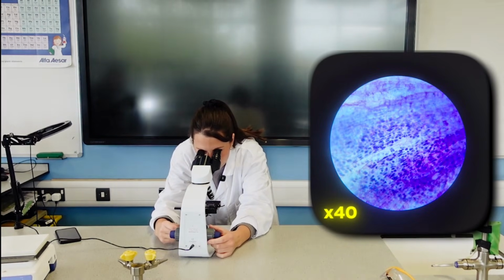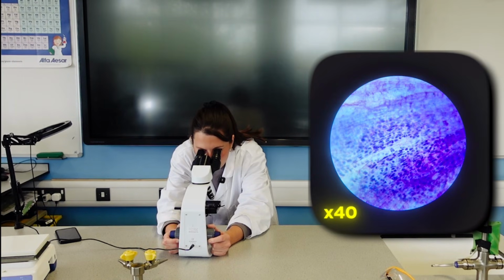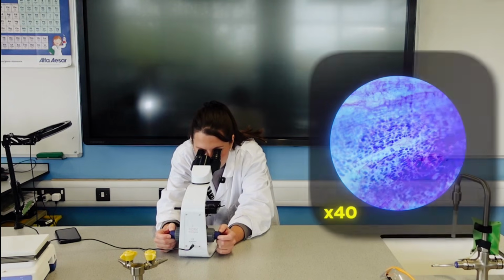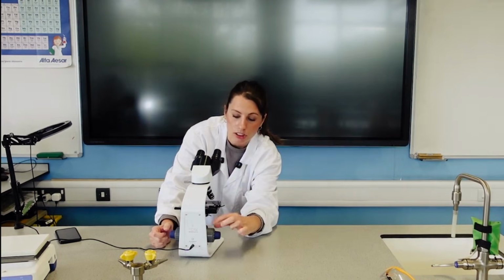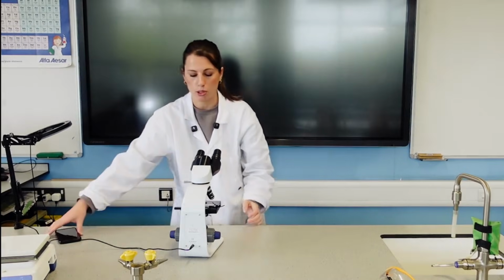I'm just going to move it around. Okay, I think I can actually see some already. It might be in stages of mitosis. I'm just going to adjust the focus and then take a photo so you can see what I'm seeing. Now at this point, it's worth noting, and just to tell the students, because you're now at such a high magnification, even the slightest change to your focus dials can very quickly make it go out of focus. So you want to be using the fine focus, not the coarse one at this stage.